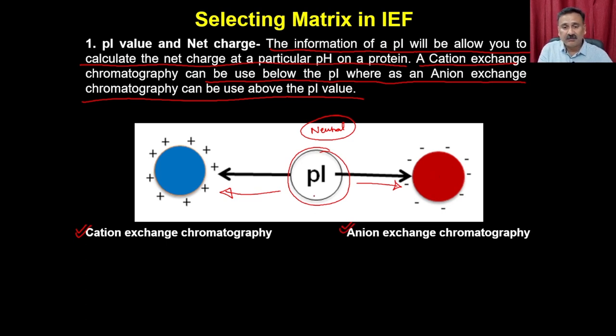Now the question comes: how can you determine the PI of a protein? Because that is very crucial and important information required to perform ion exchange chromatography.